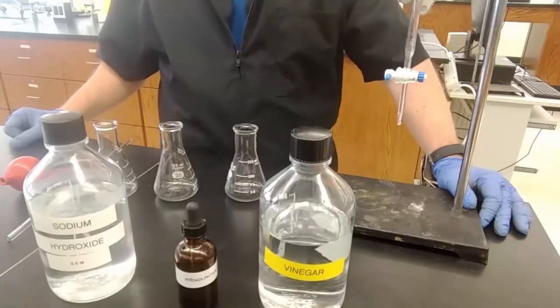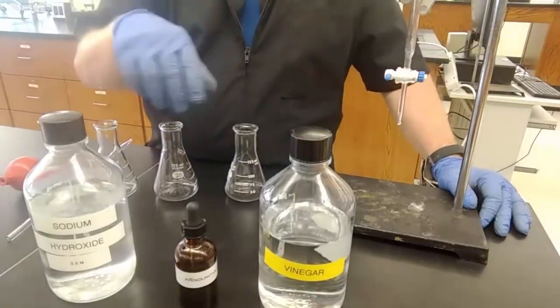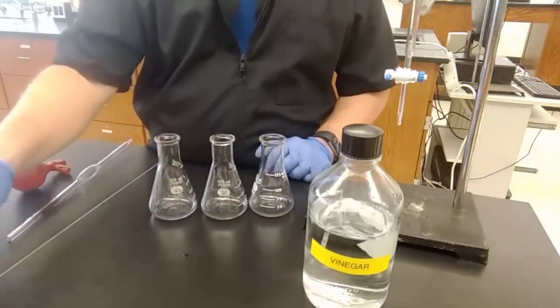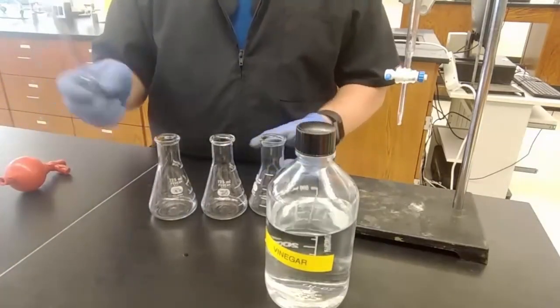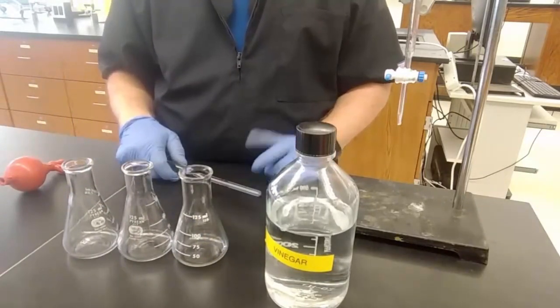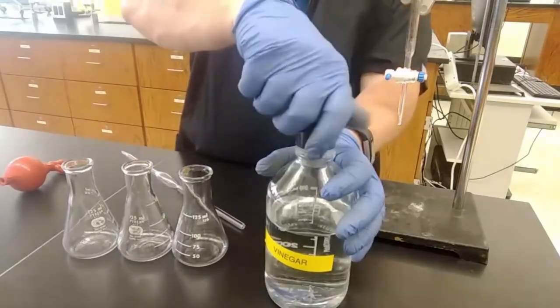So here we go. It says take 30 milliliters of vinegar and add it to a 100 milliliter beaker, and then take 10 milliliters into three Erlenmeyer flasks. Since I'm the only one doing this today, we can go straight to pipetting 10 milliliters into three Erlenmeyer flasks. We're just going to do the experiment three times to make sure that we can confirm our result, which we learned in the pH lab can be pretty important.